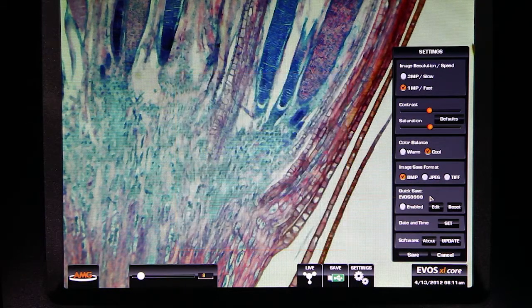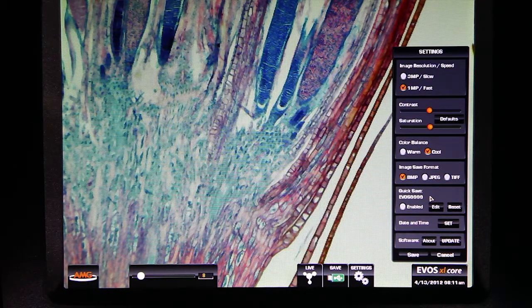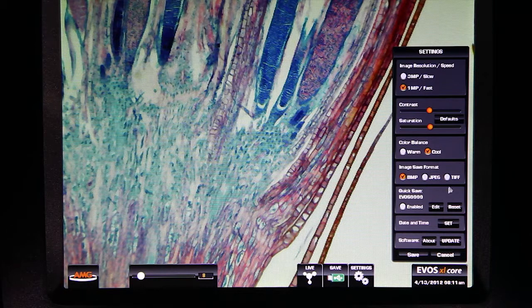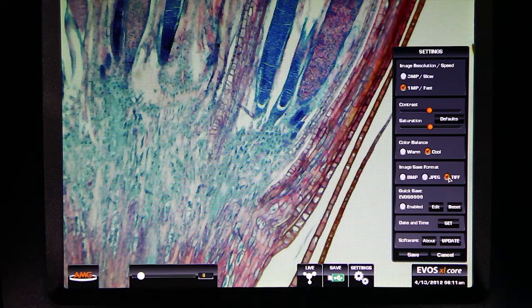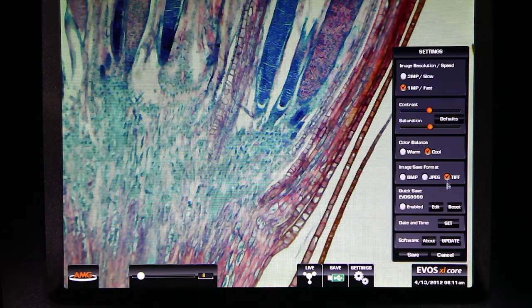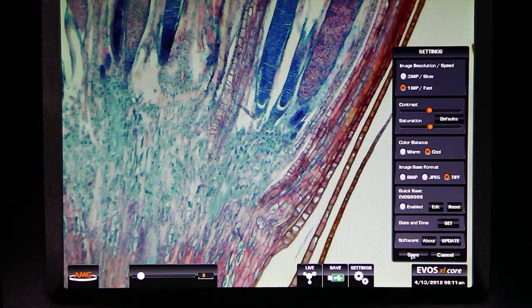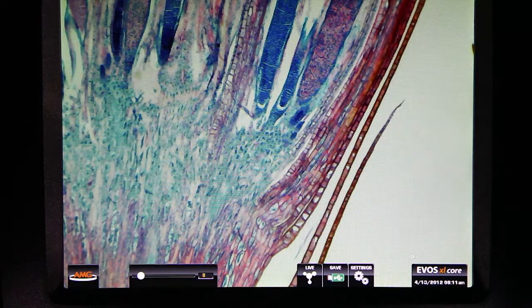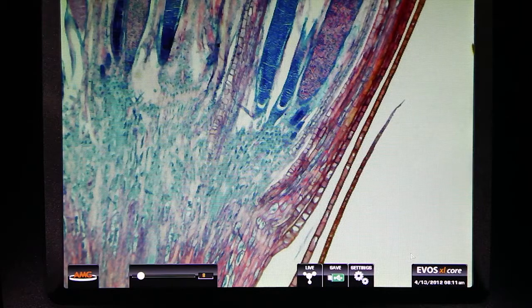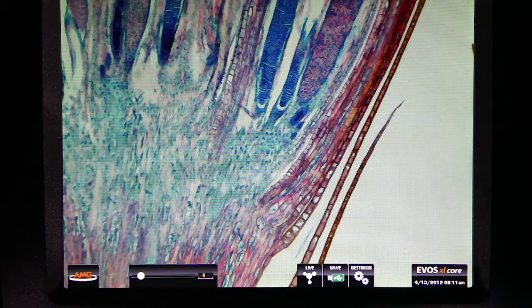After setting up the base file name, I need to choose the file format. Images can be saved in bitmap, JPEG, and TIFF formats.